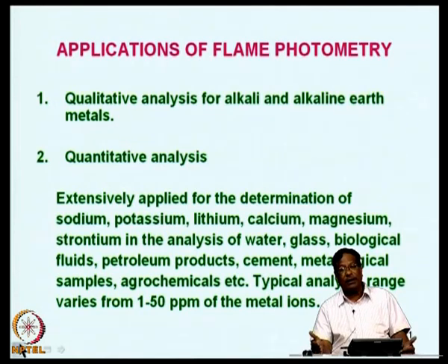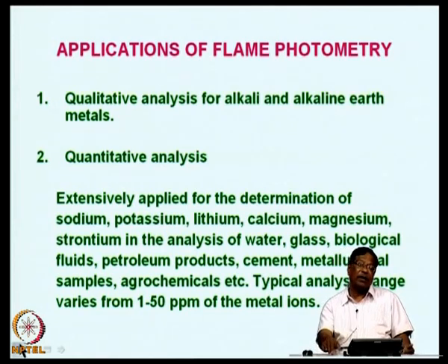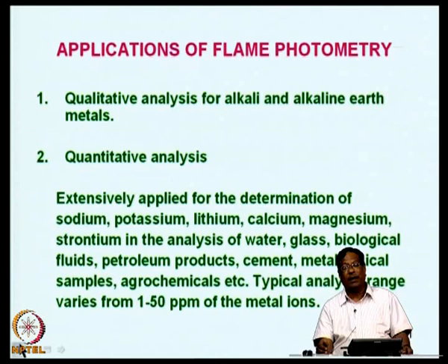So, in emission there is nothing like a fixed linear response system, but you can adjust the signal in such a way that you can do the determination at very low concentrations as well as very high concentrations.